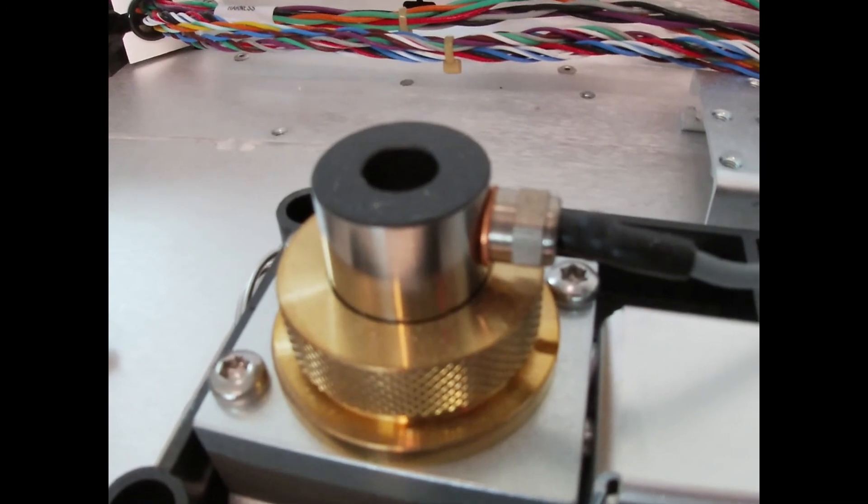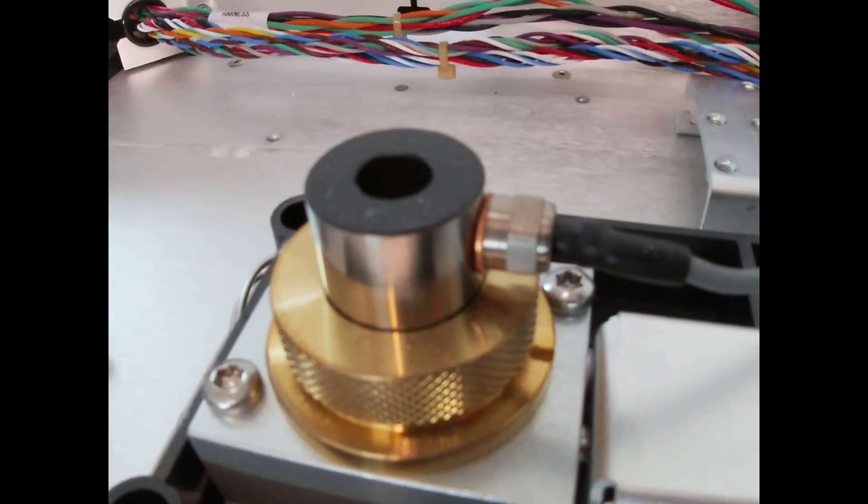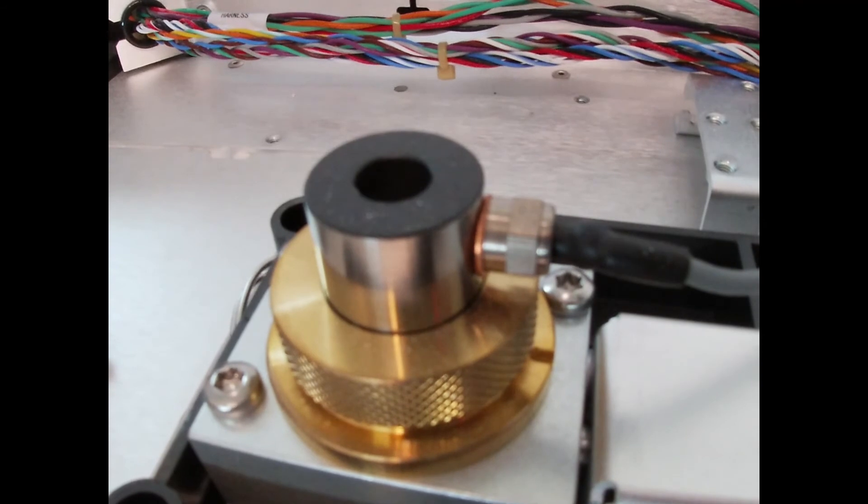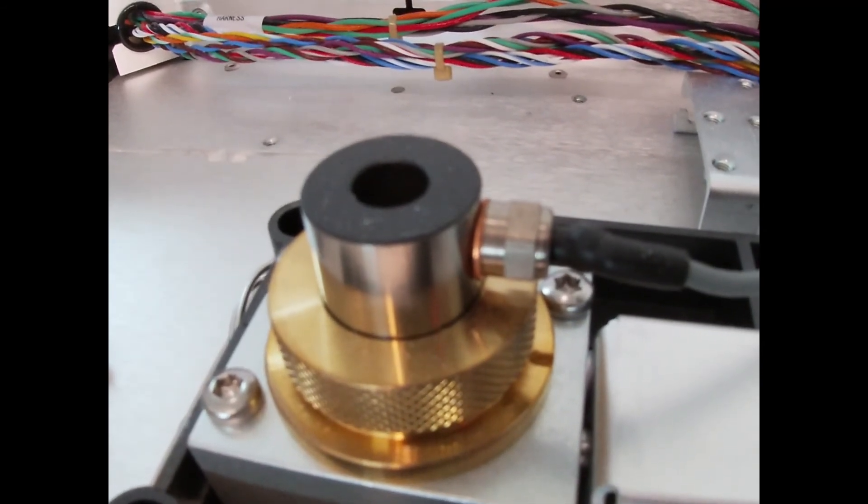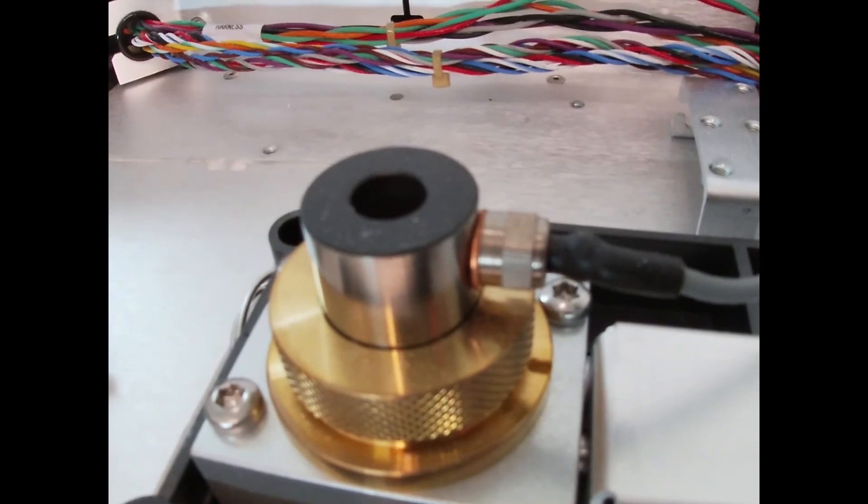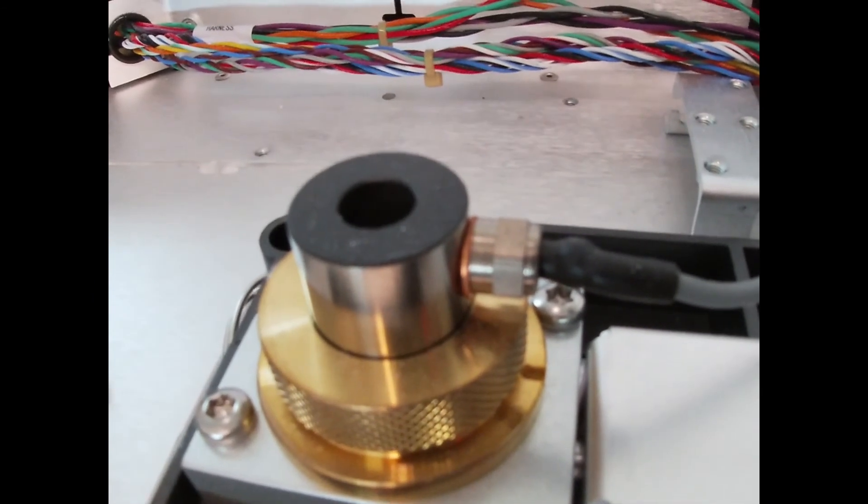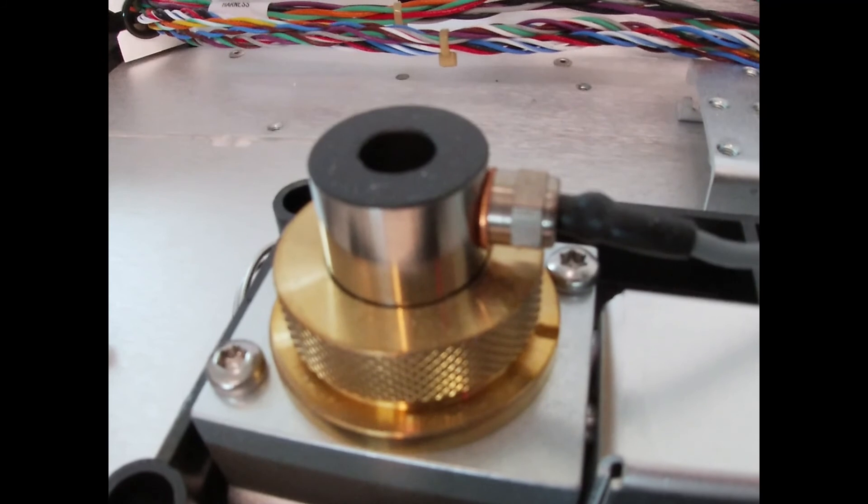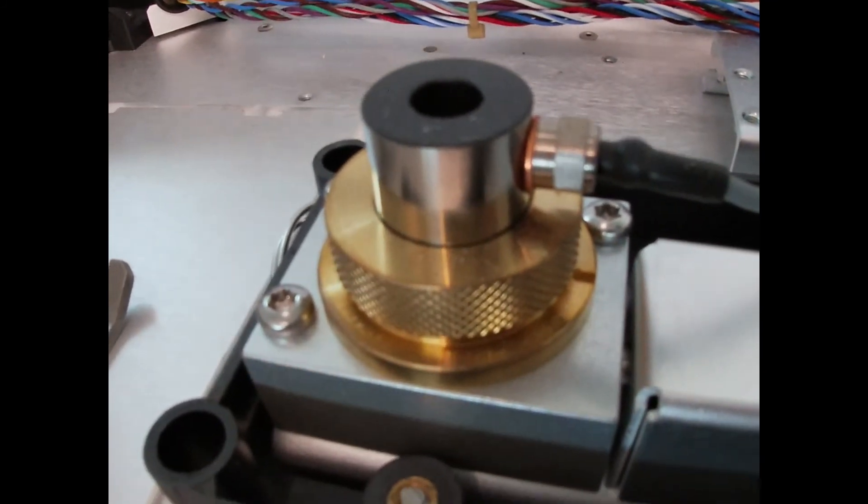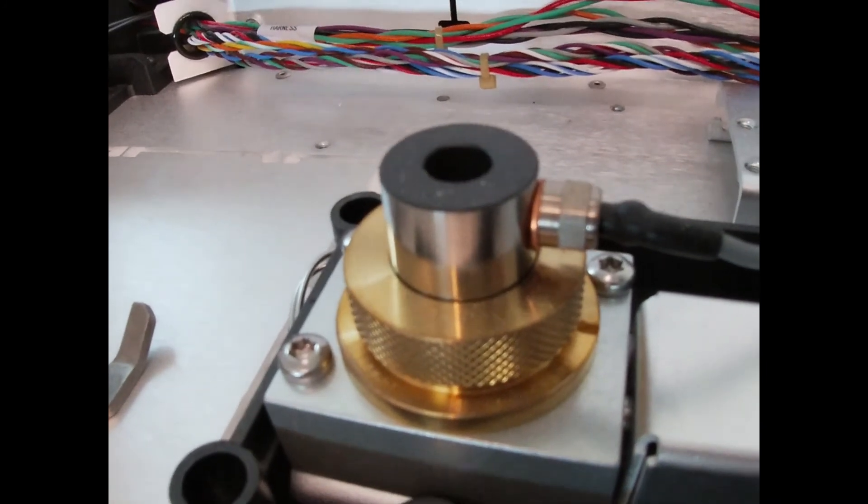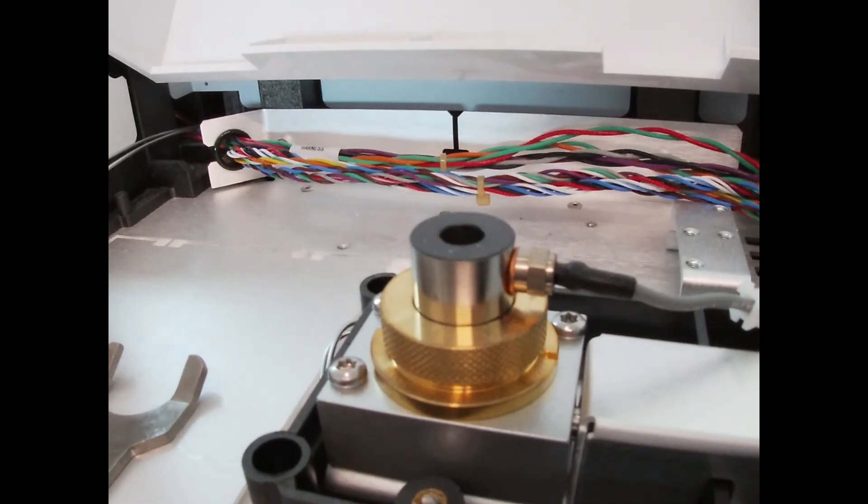And it forms CHO ions basically, and so those ions are conductive. We produce a current that's picked up as a signal and that output gives us peaks over time as the sample elutes. The more carbons it has, the higher the current it produces, and so that's reflective not only of the concentration or the amount but also the mass of the molecule. Those with the larger numbers of carbon atoms will actually produce a higher signal, so it's a mass dependent detector.